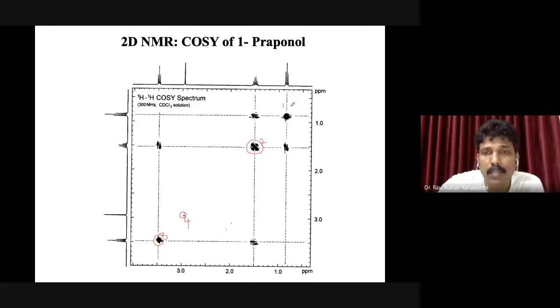There are four diagonal peaks, and for the four diagonal peaks you just draw a grid line to this axis. This is something that we are trying to understand. This is the first scale. This is the delta 1 scale. This delta scale we are trying to understand, and you have one peak here.